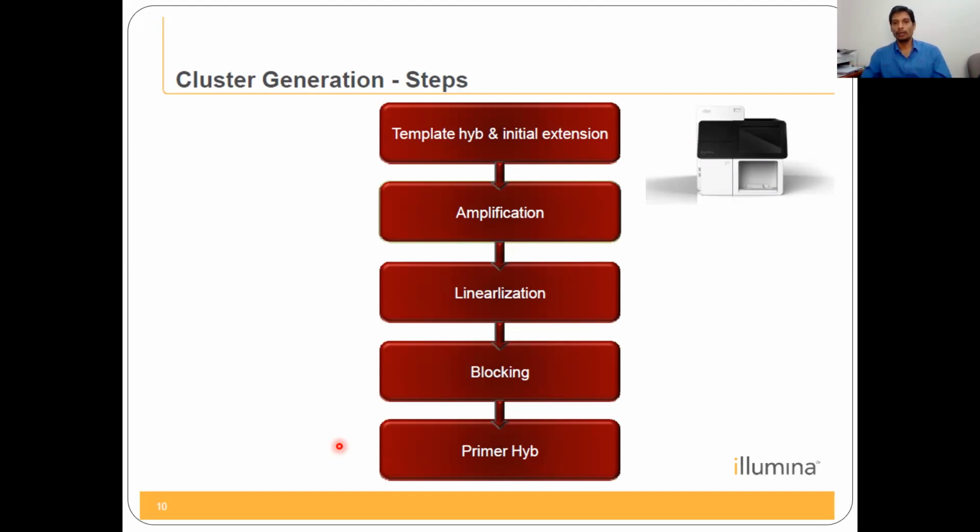So it makes the second strand synthesis. For that you need another temperature, which is feasible for the DNA polymerase you added. In most PCR you add Taq polymerase, and 72 degrees is the ideal temperature for elongation. So you increase the temperature to 72 degrees, and it will get elongated.